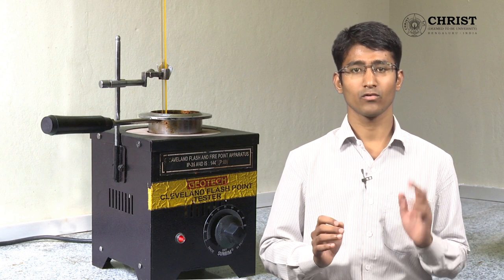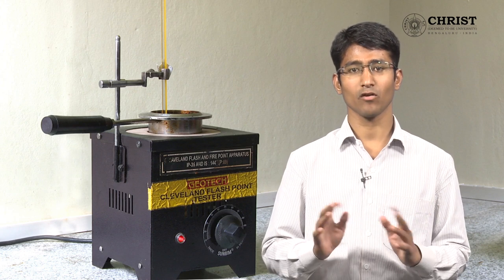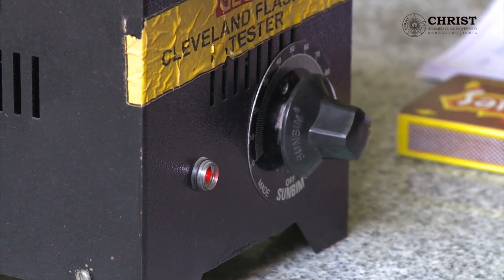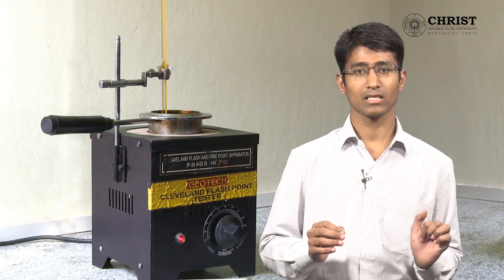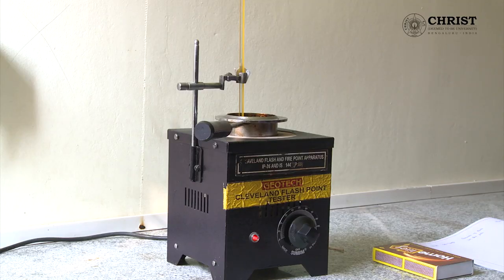Make a table of two columns — one column for temperature and another for the presence of flash or fire. Switch on the apparatus; a red light will glow and we have to maintain the voltage between 60 to 90. After a while, when voltage gets stabilized, the light will automatically go off.